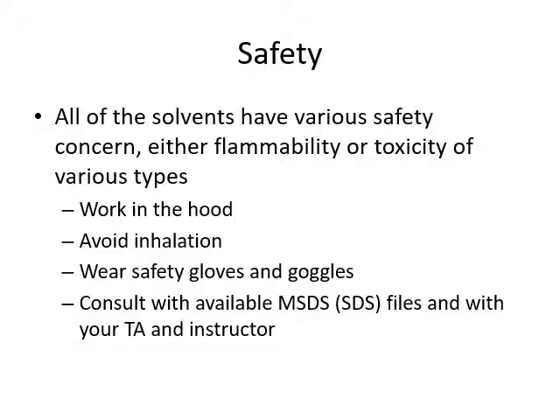Your face cannot be near any of these solvents. You have to wear safety gloves and goggles. You have to put all the barriers available to you between your working materials, your chemicals, and yourself. And you always should read the SDS files, or at least the bottle labels of the chemicals that you'll be working with.